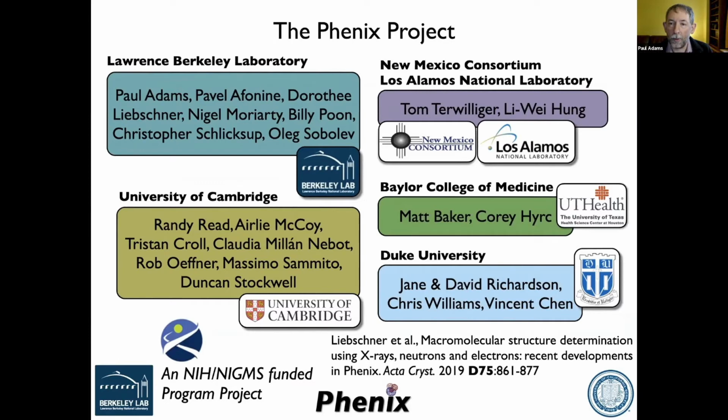And so a biologist that comes along and gets your model and sees a ligand in there when you didn't actually have any data for it will assume it's all true. So you want to be very clear with somebody, what was your evidence for that ligand? And if your evidence was it was in another structure that was prepared under the same conditions, you just got lower resolution, that's an argument, okay, but you should explain that to somebody in the paper and the deposition.